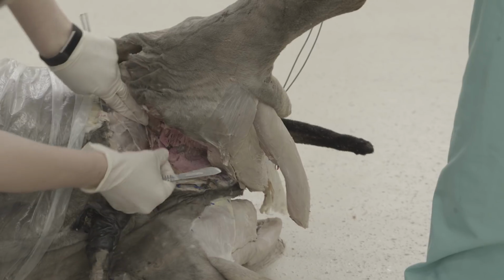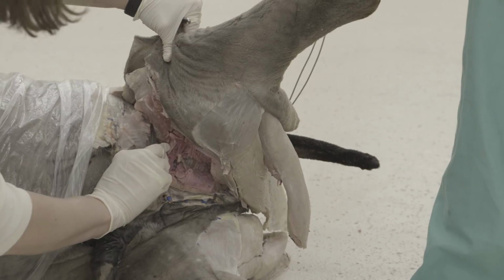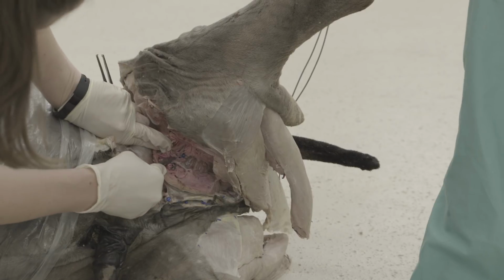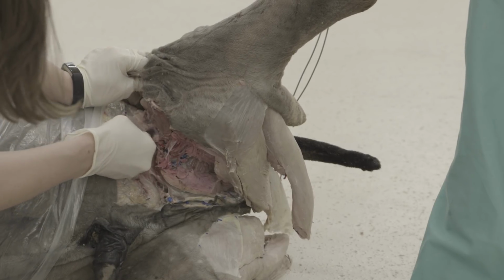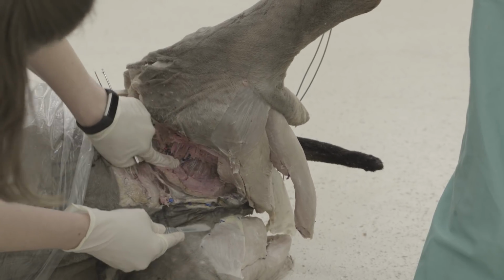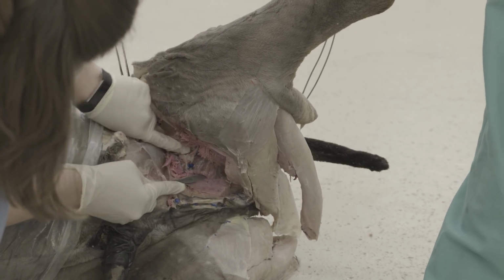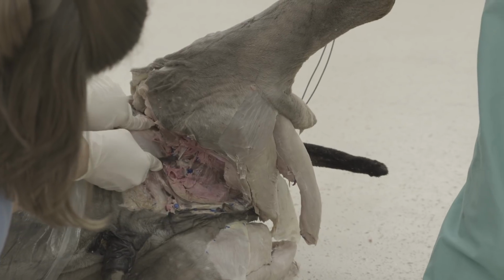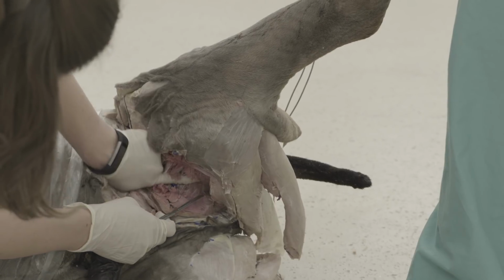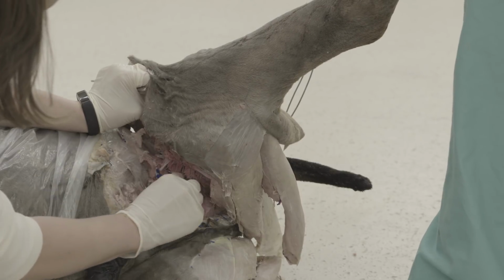And then you'll eventually get into where the hip joint is, and I'm going to try and show you the accessory ligament of the femoral head. And try not to cut through it before I show it to you. All right. So then we're going to cut through these vessels. Try and find our hip joint here. And I'm cutting through pectineus now.